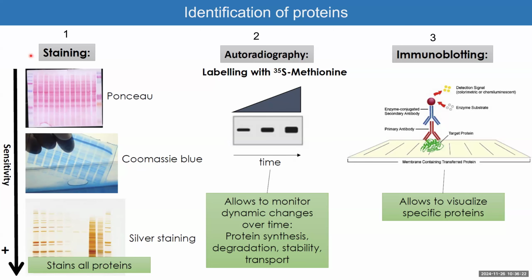Usually we load the marker in the first lane. This researcher here applied the marker in the first or the second and the last lane.